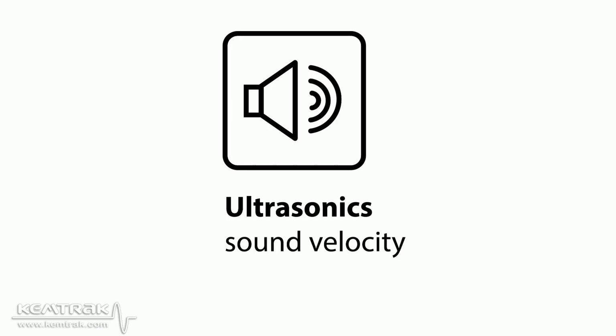Ultrasonic measures the change of the speed of sound as it passes through a liquid. The frequencies of these sounds are above the audible range and start a bit higher than where my voice ends, because I am a bass baritone and I can't sing above 20 kilohertz.